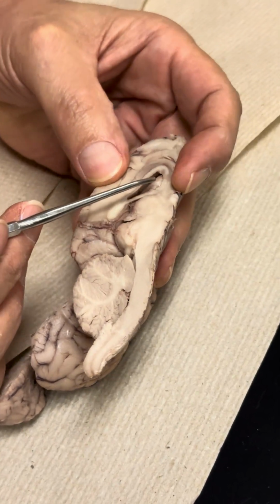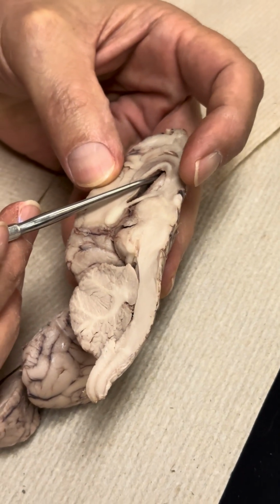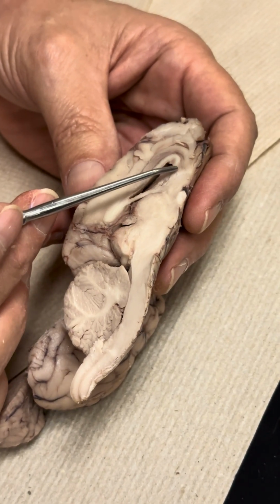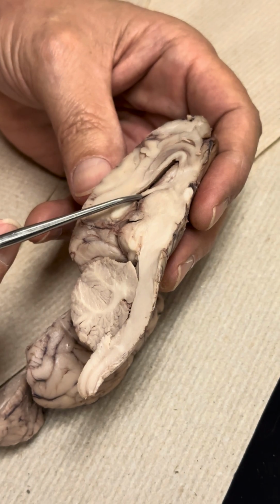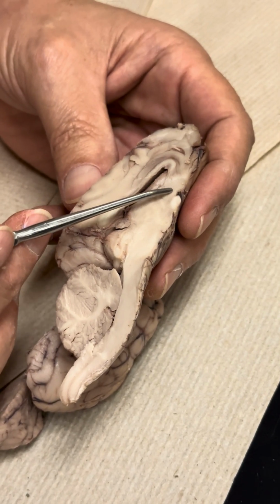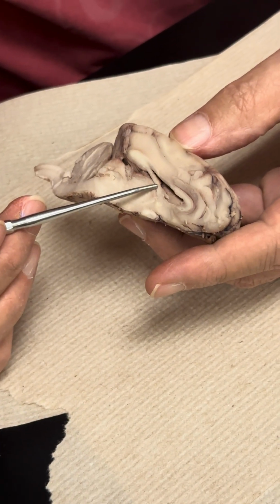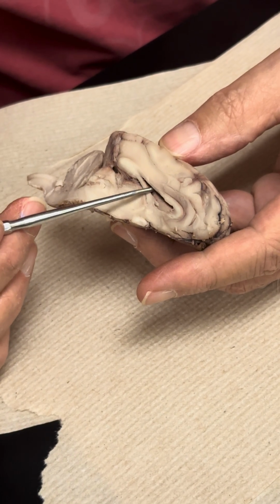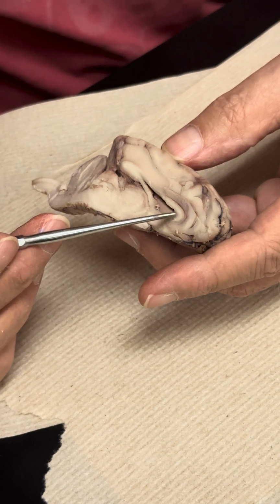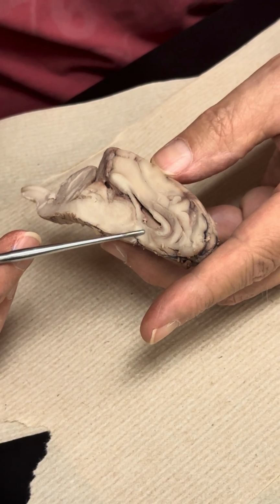So this is the left lateral ventricle. It's filled with cerebrospinal fluid. The floor of the lateral ventricles is formed by the fornix. The fornix goes all the way down to the hypothalamus. Can you point to the fornix? Okay, so that's the fornix, the floor of the lateral ventricle. Here's your lateral ventricle, here's your fornix. It also comes from the genu and comes down like this to the hypothalamus.